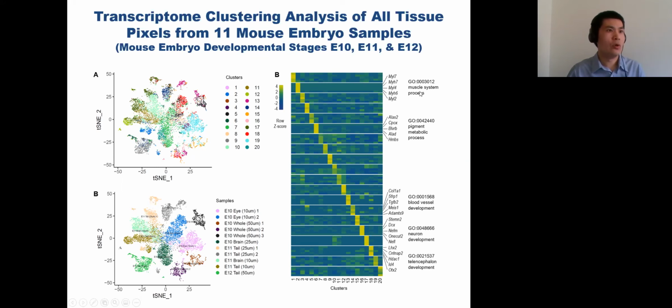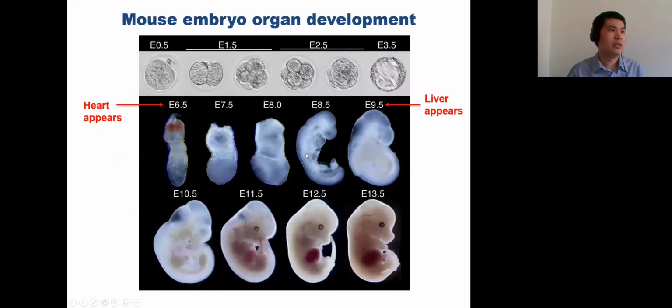And also we can really do a GO analysis to show the different types of those clusters. Then I want to also introduce a little bit of the embryo organ development.